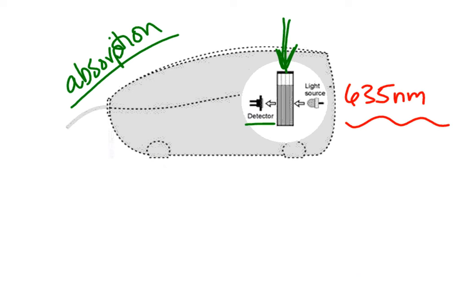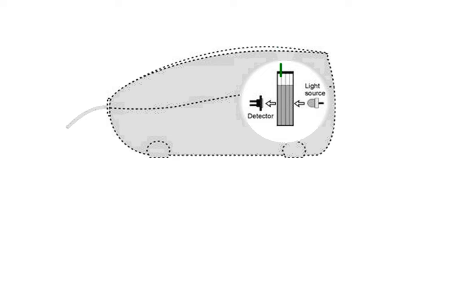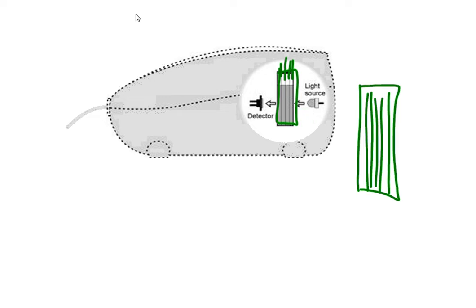Also, when you're looking at this, if you take a look at this cross-section diagram, it looks like there's little lines right here. It's because if I was to hold this up to you, obviously I can't because it's not three-dimensional, but in the z-axis on this side and on the other side, there are little lines that are going to indicate this side does not go where the light goes. The light should go on the clear side. So this side right here, and this side right here should be clear, and that's the direction of the light. You don't want the light to hit these lines because then it'll mess up your results, not to mention disperse all the light.